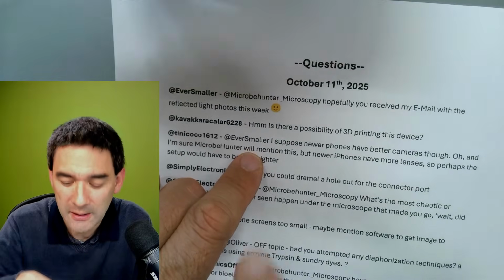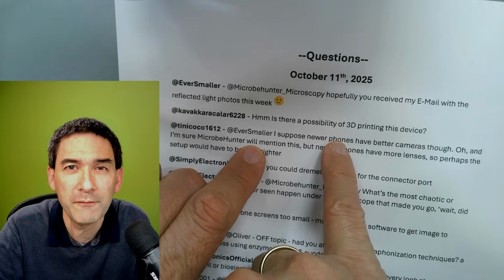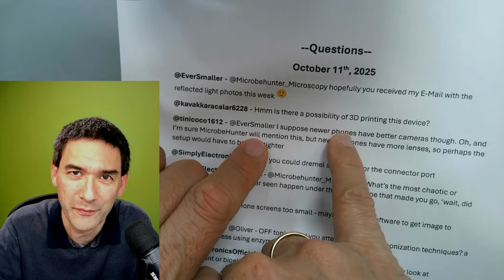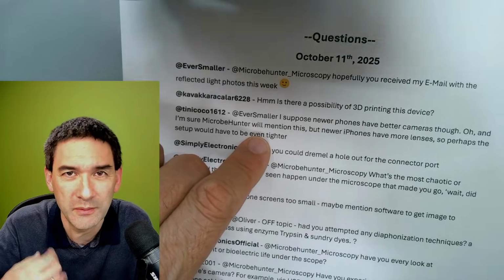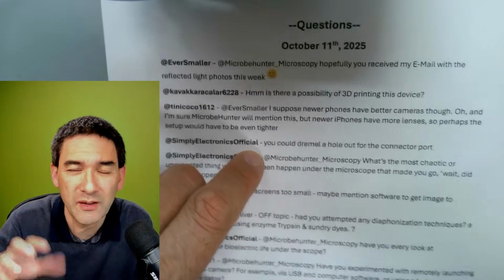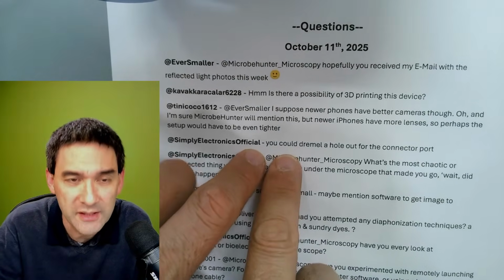Why am I saying this? I'm saying this because even though cameras are important, I found the bottleneck to be not the cameras in most cases, but the optical systems of the microscope. Yeah, so that's also something that I just want to make you aware of. So generally with a mobile phone, the image is a wobbly situation and it's not always very stable, but generally the image quality is pretty okay.